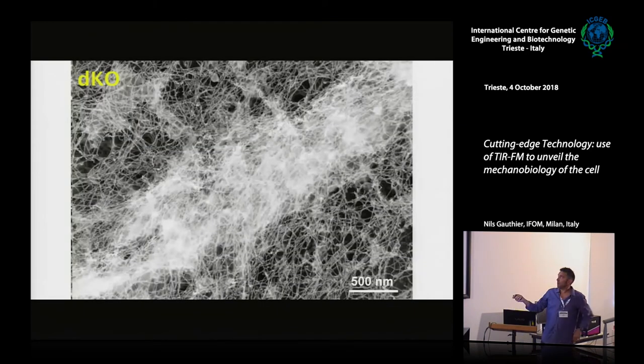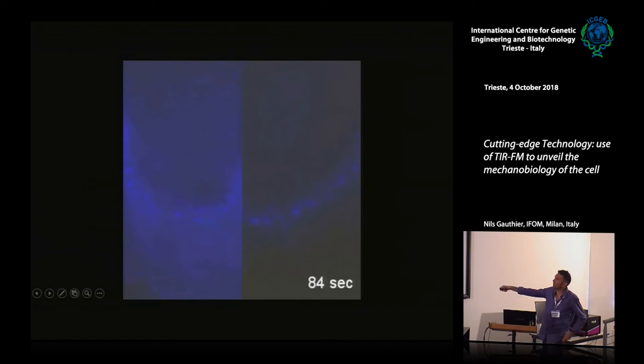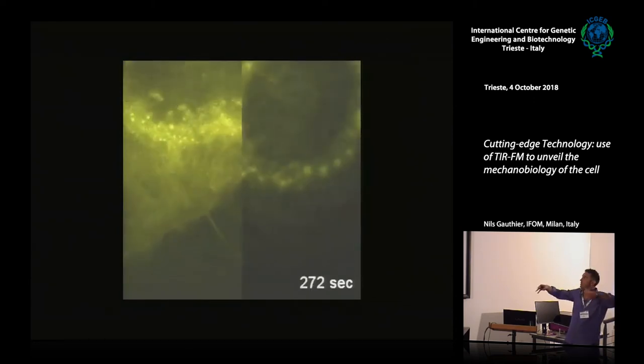Then you can start to think, okay, this may not be a problem of polymerization per se, but a problem of depolymerization. In fact, what I have here is a problem of clumps, and they act as a glue. Now you look at that, then you make movies in the context, and you follow those. Here we did TIRF, and we color encoded the movie, and this is what happens when cells are trying to collapse. They are making these adhesions, and they are moving their adhesions like that.